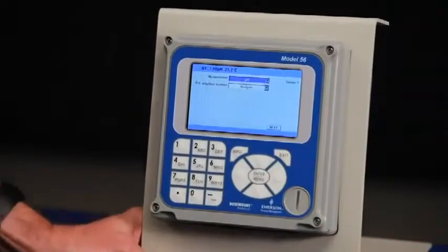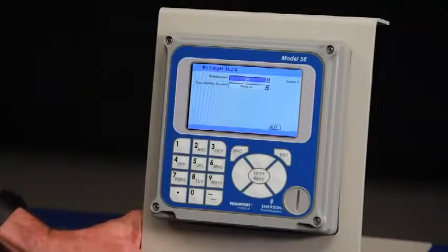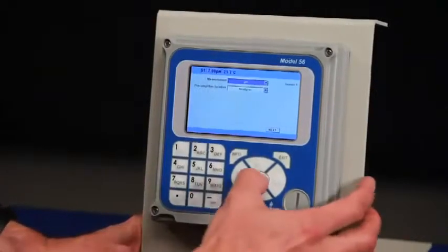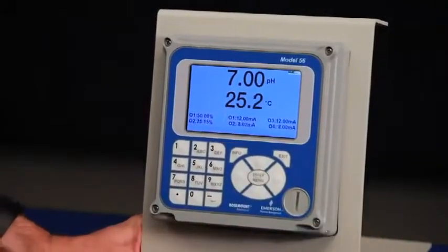The quickstart screens automatically detect which measurement boards, and in fact, which sensors are connected to the device, and the unit is up and running within seconds.